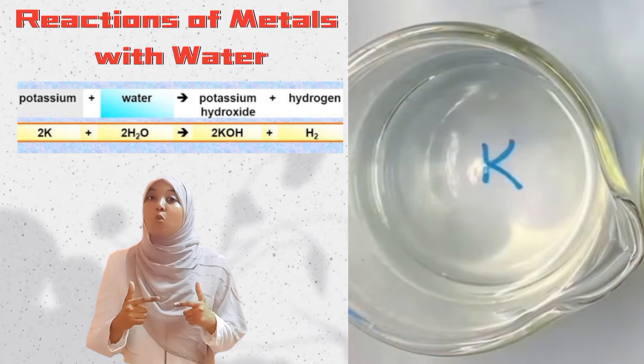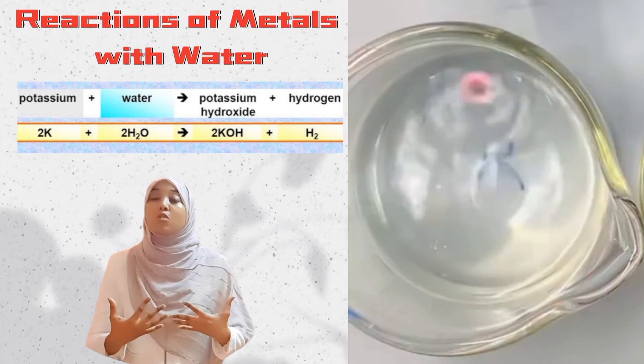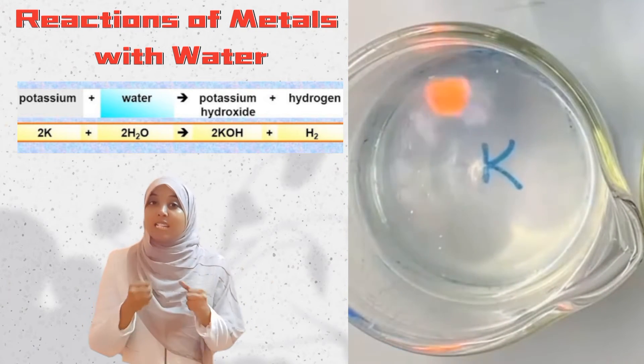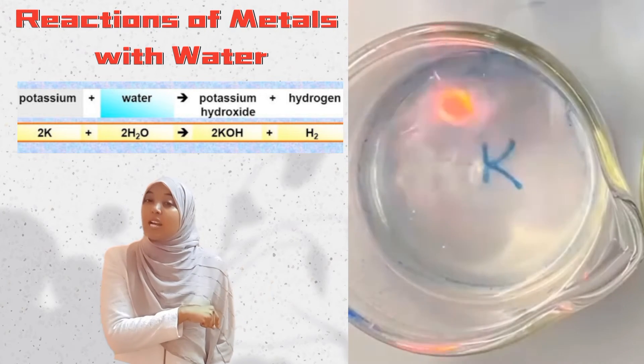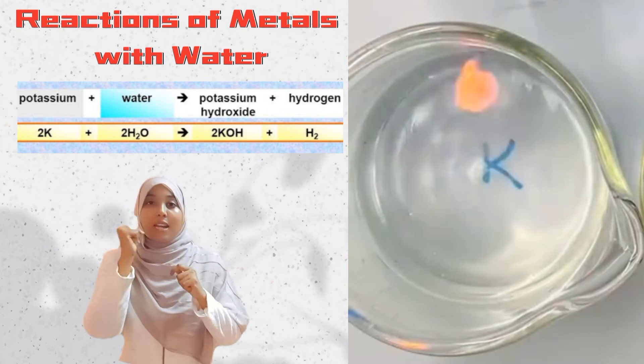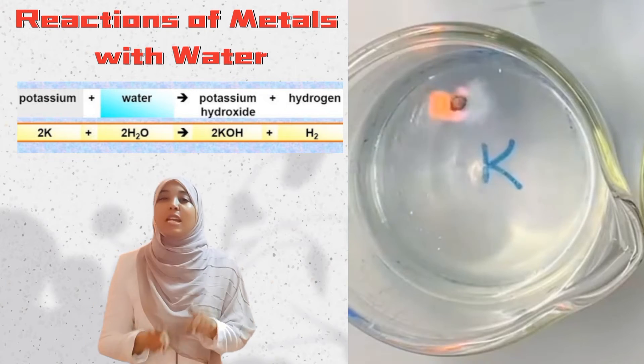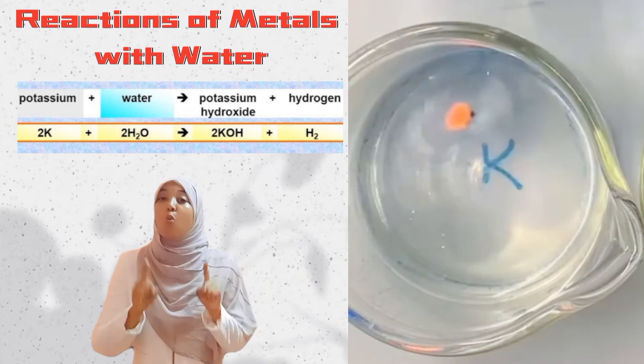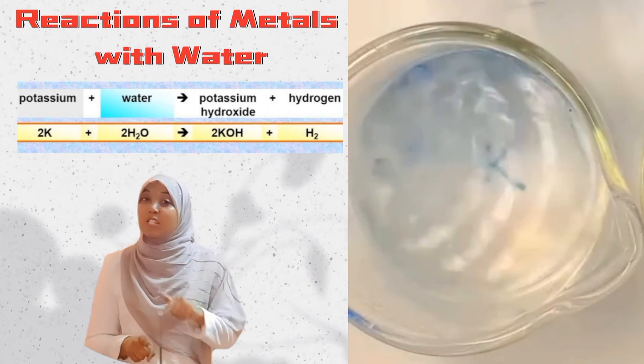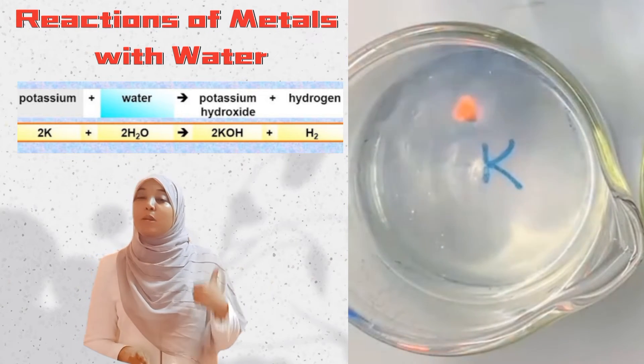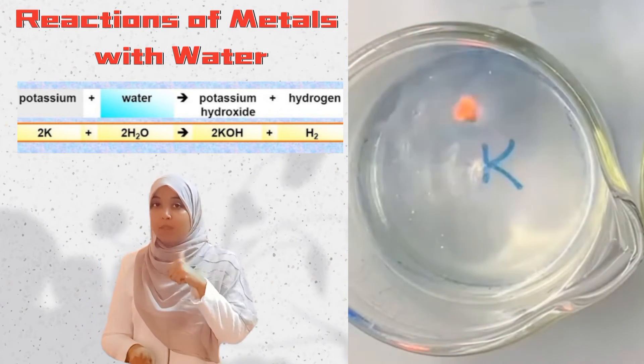Hydrogen gas does not burn with a lilac flame. The reason we're seeing this color is because of the presence of potassium vapor.